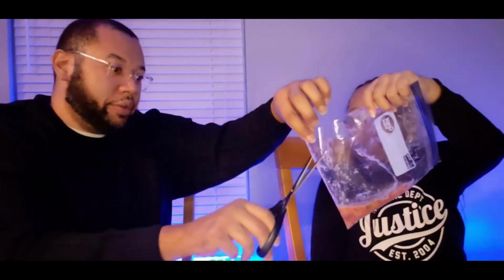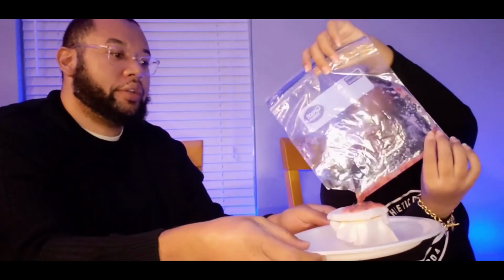So I think, yeah, I know you're ready for the messy stuff. I'm going to sit this cup on top of our plate here. We're going to try to do this without spilling it everywhere. Okay. So let's show everybody here. We're going to cut this corner. Corner cut, and we're gonna slowly pour that. Be careful, get it right on there. All right, get it on the top. That's good. So y'all guys can see that.